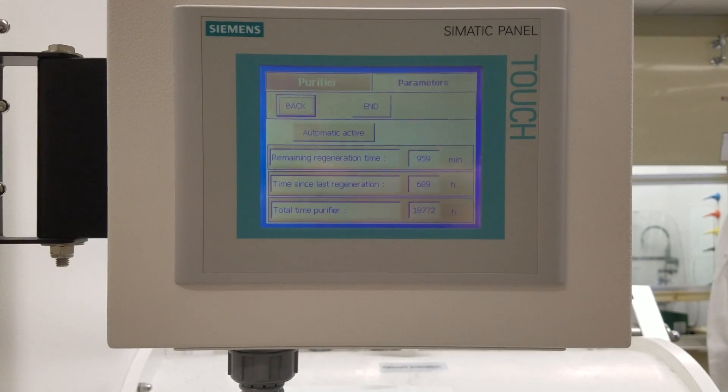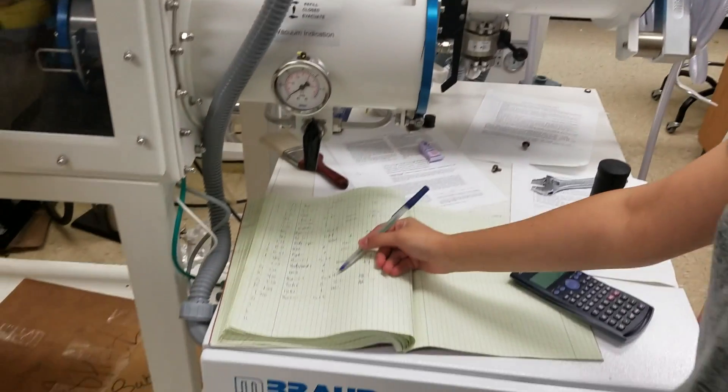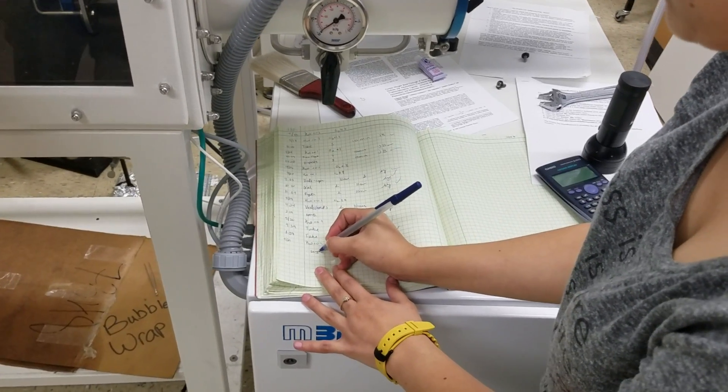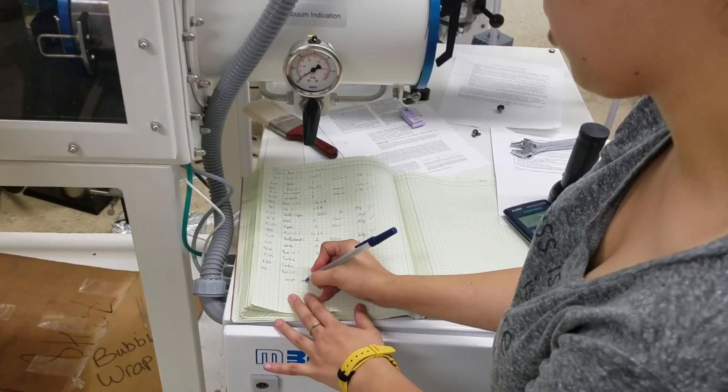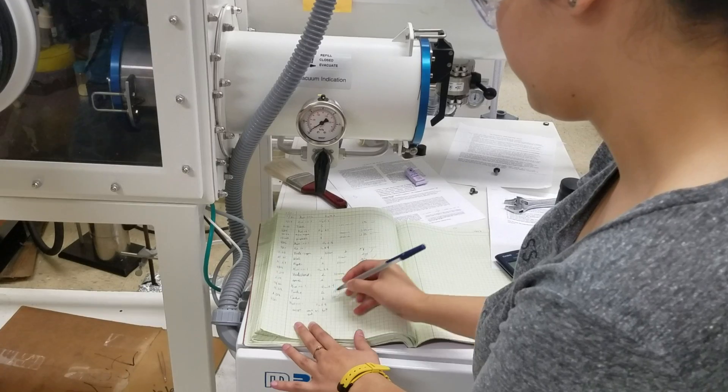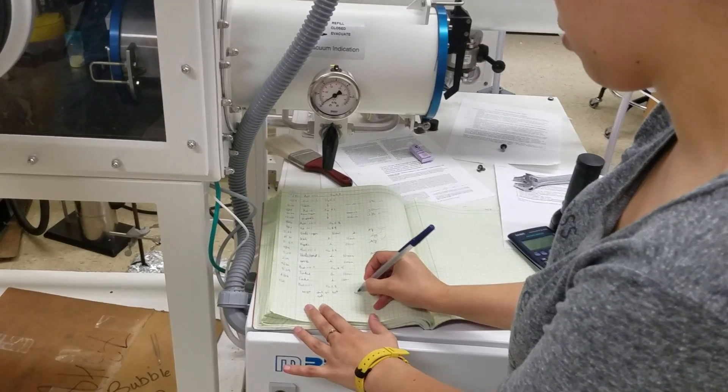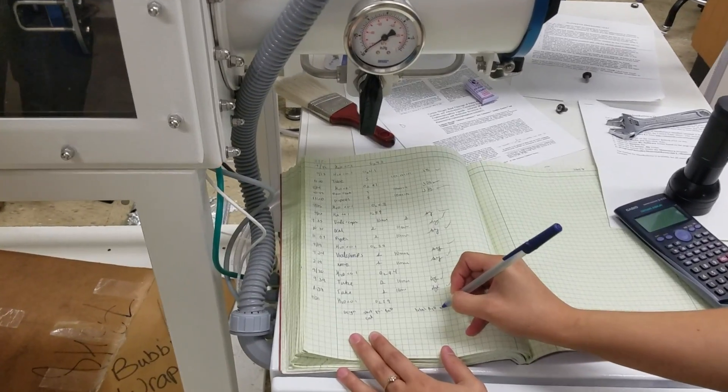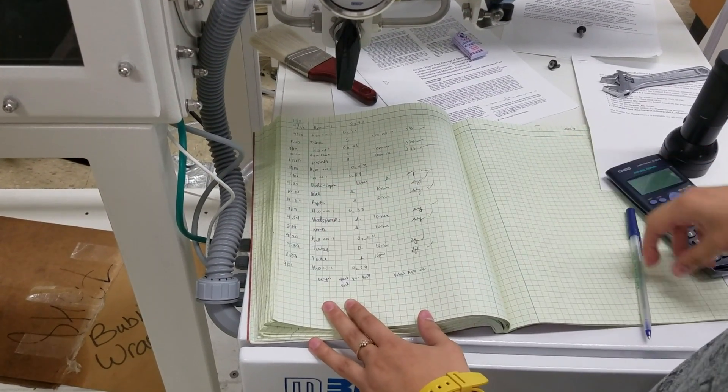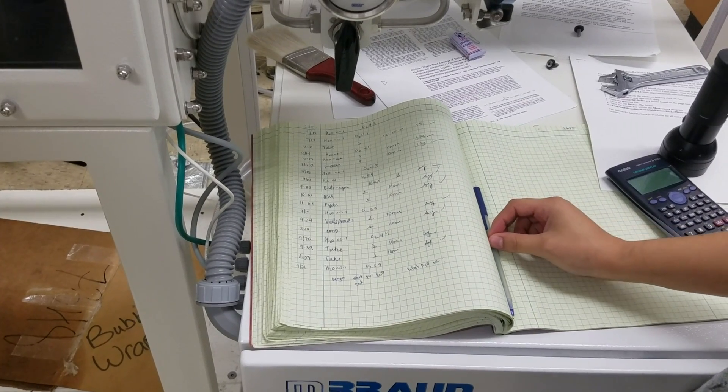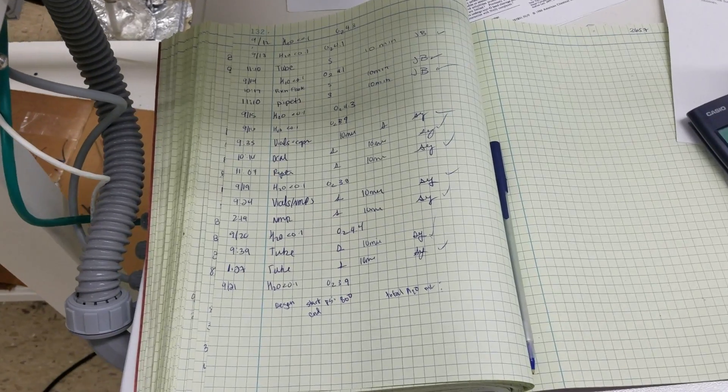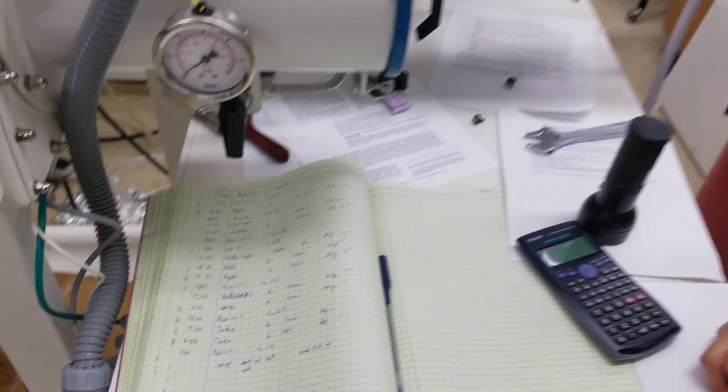Make sure that you document everything in the logbook. So, typically what we do is we write a regeneration, a starting, and an end PSI. In this case, we're about 800, as well as a total water in milliliters when we come back the next day. And so, all of this stuff should be filled out once the regeneration is over. In that case, you just disconnect everything and put everything back. That's about it.